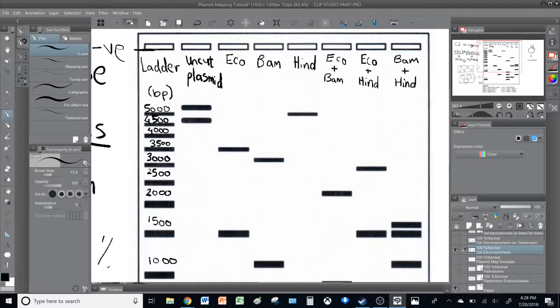So you start from here. This is where you place the 0, and then you measure all the way down to the bottom edge of each band like this. So you'll measure from here all the way to here and then record the distance.